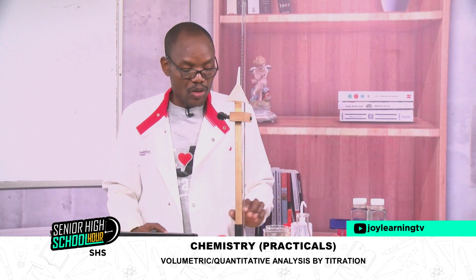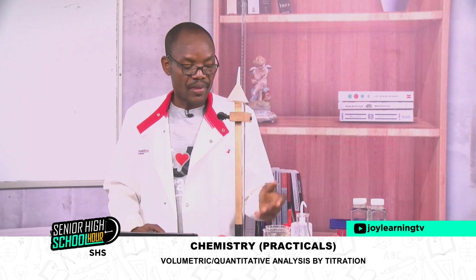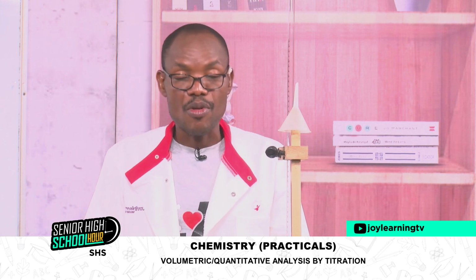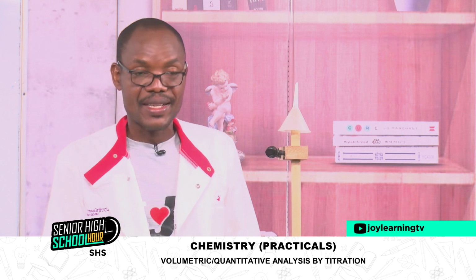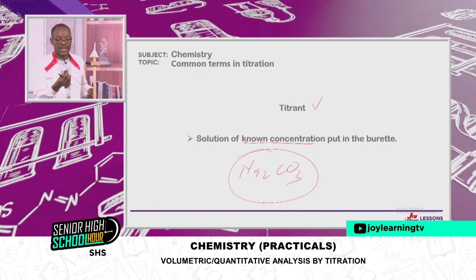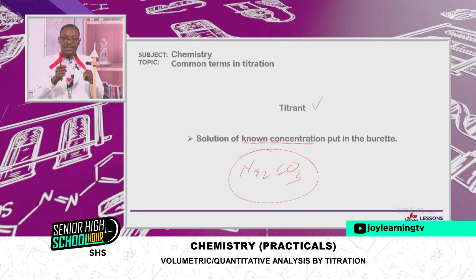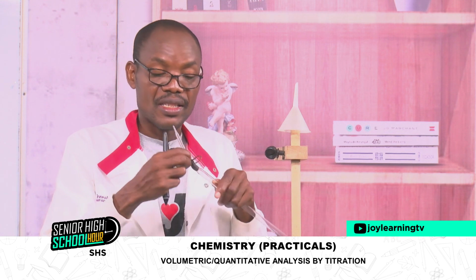Now the reason why most of the time the base is not advisable to be put in the burette is that the base, for example sodium hydroxide, can react with atmospheric CO2, that is carbon (IV) oxide, to form sodium carbonate. This sodium carbonate can serve as a cement to cement the cork, that is if I'm using the cork type of burette, to cement the cork, the tap, to the main burette. So turning it becomes difficult. Some of the corks are made of glass, and the burette itself is glass, so it will cement and opening becomes difficult.